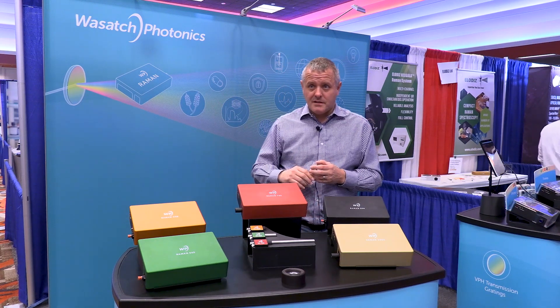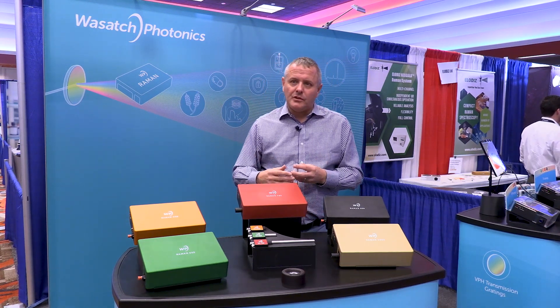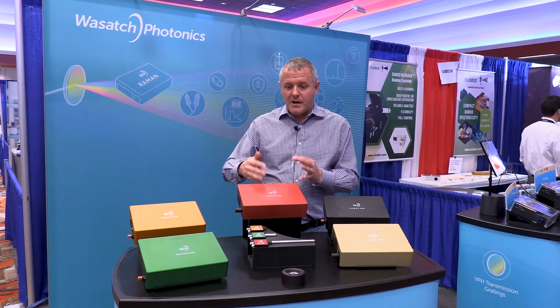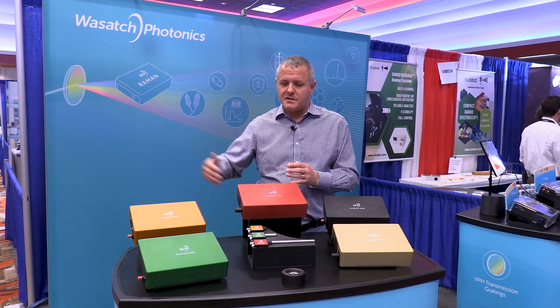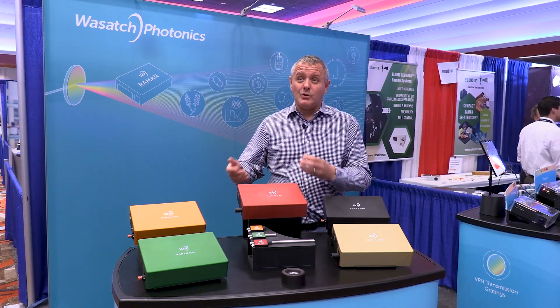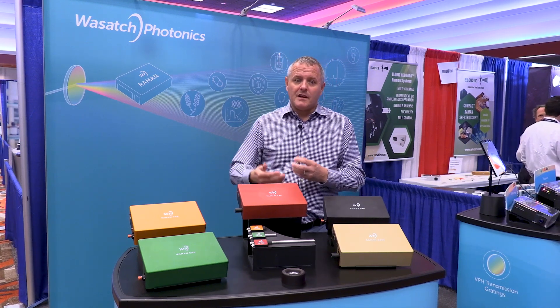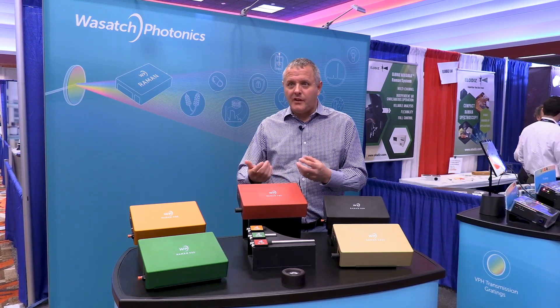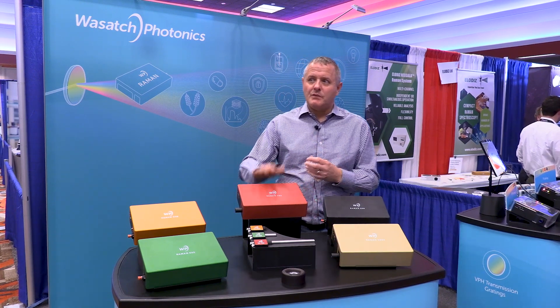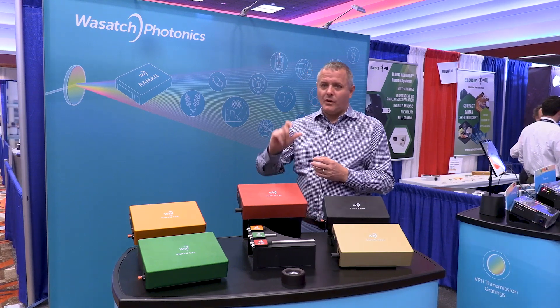In our benches we give the option of two different types of detectors. Whether you want a good-enough detector — very good for mid-level and strong emitters, cost effective — thinking about that strategy of providing point-of-use, we offer that detector. We also offer the higher-end, higher-cooled cameras for weak signals and low light levels, thinking about limits of detection. If you're trying to find things in healthcare, being able to see them earlier at lower light levels, we've got that option in the detector as well.